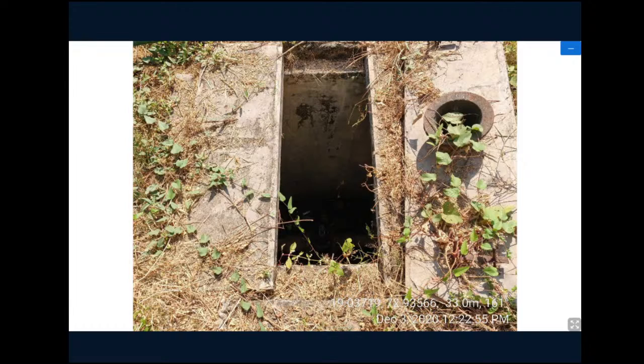I'm really excited. What is this actually? The microscope, and what do we understand by microscopy? It has also been told to us that there is a world in a small drop of water, right? What are all these things? Why are they not visible to our naked eyes, and how can we actually see that world? Let us start by asking what students see here. We'll take some responses from the students: what do you think is in this picture? What are the things that are there in this picture?